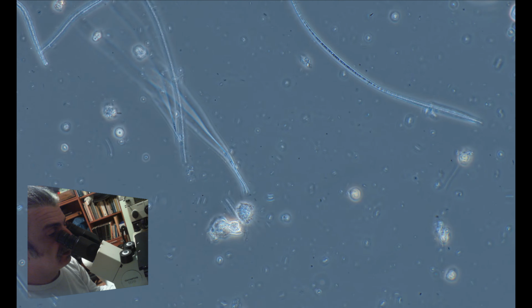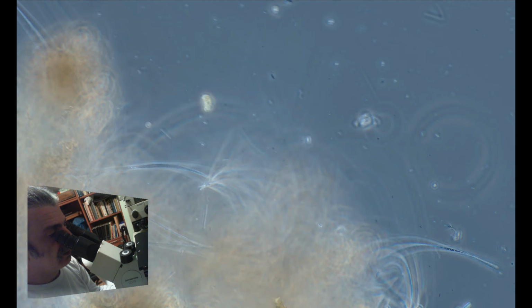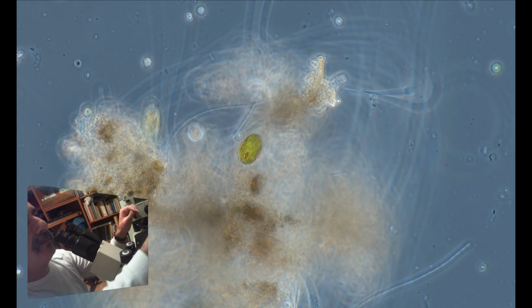We've seen a lot of species, and next time that I'll find an interesting sample, I'll surely, just as I was talking, here is Trachelomonas, so I'll move back to the DIC, and we can look at it in more detail.